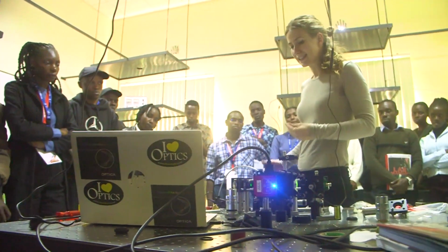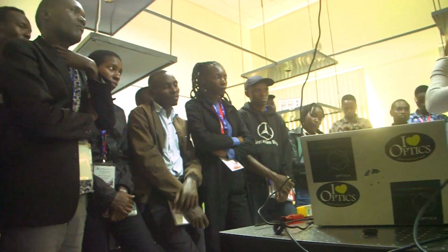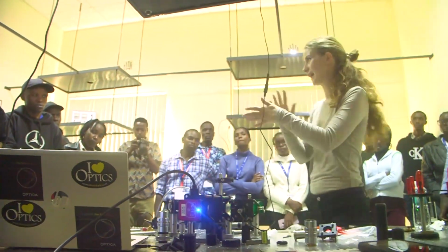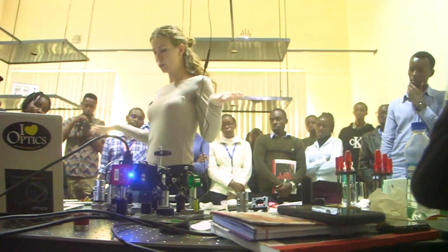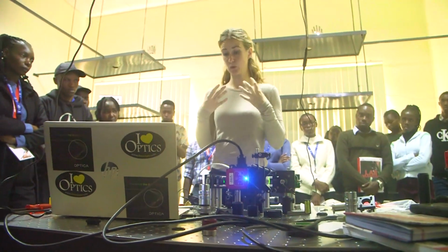And then the other thing is my beam could be tilted. If it is tilted like this, I won't see an image that is focused because the focal plane is flat. And if I arrive with a light sheet that is tilted, it's a mess. So how do we solve the problem? Well, we need something that allows us to be precise.